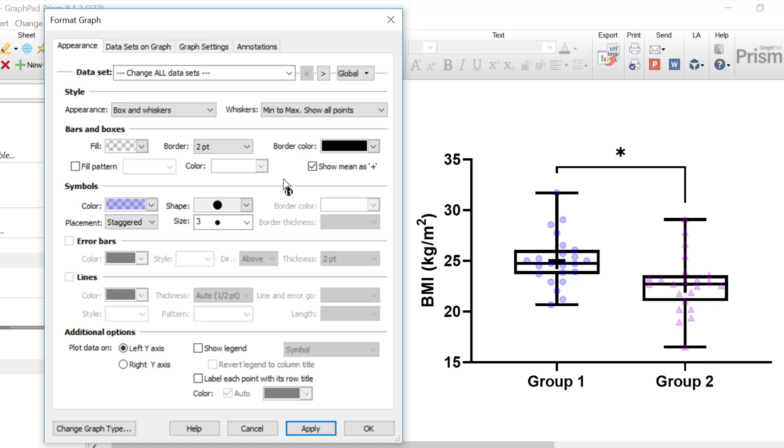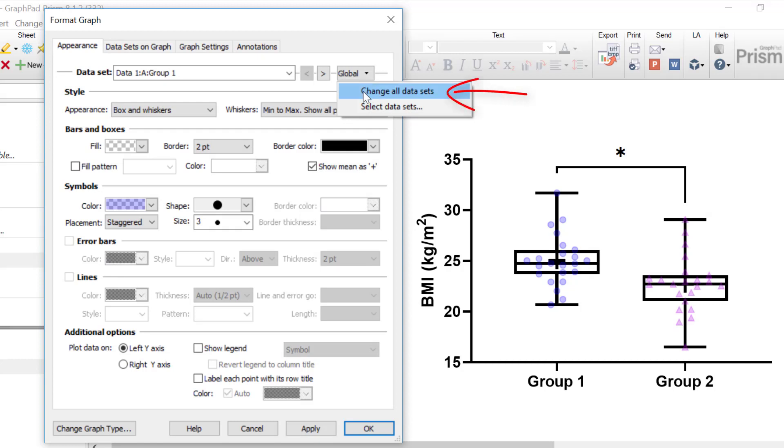Another way to change the global settings is to use the top right drop down menu and change the option to Change All Datasets.